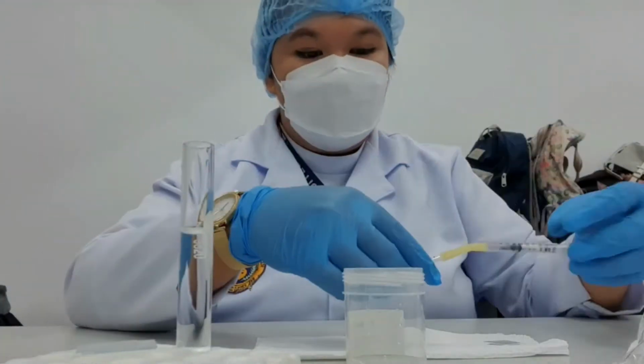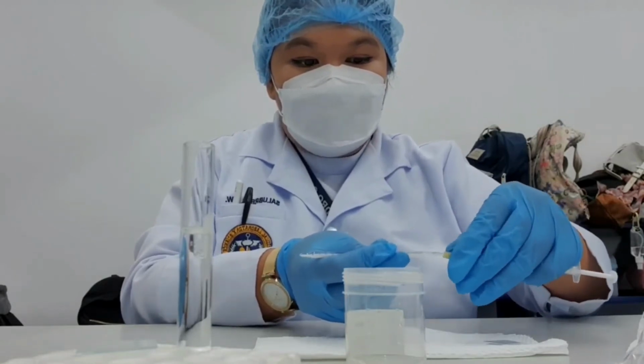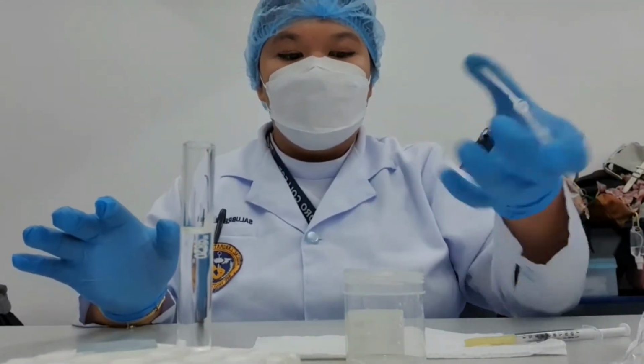Then, hold the WBC pipette horizontally and carefully remove the attached rubber tubing. Afterwards, seal the ends of the pipette with the index finger and thumb and mix its contents for 2 minutes.